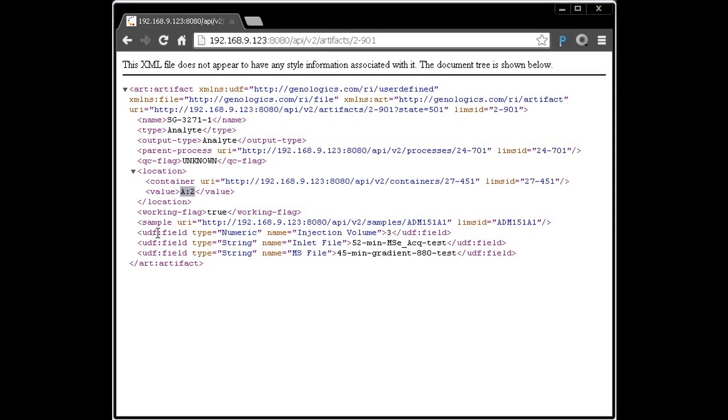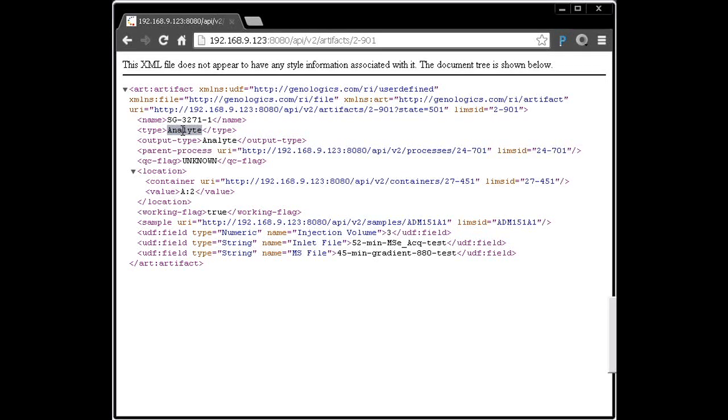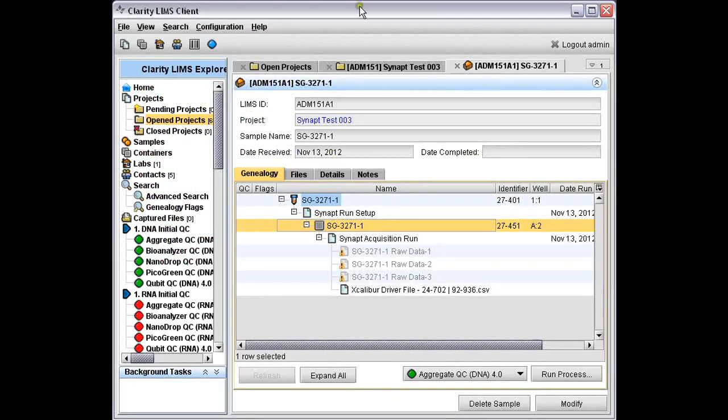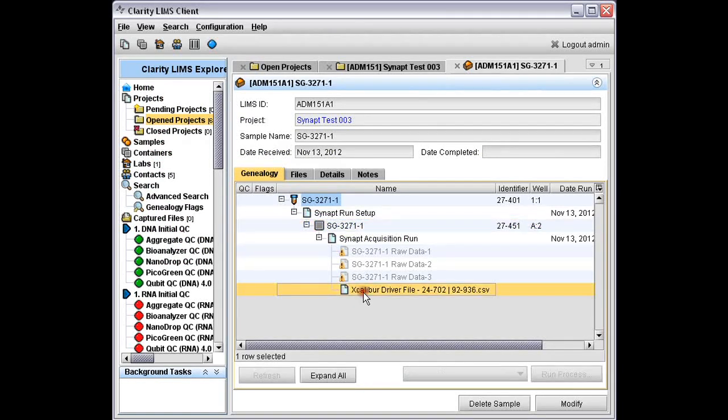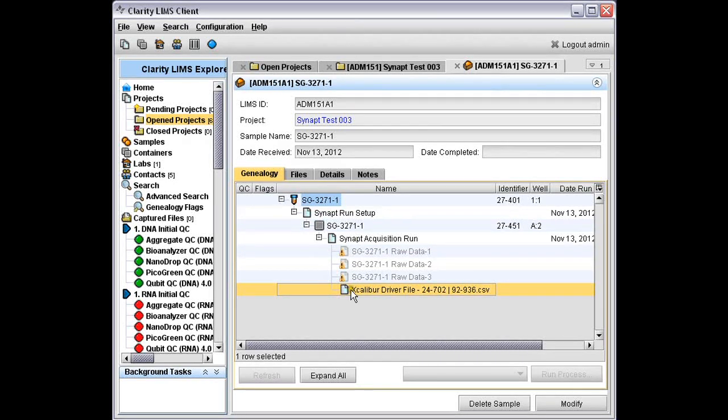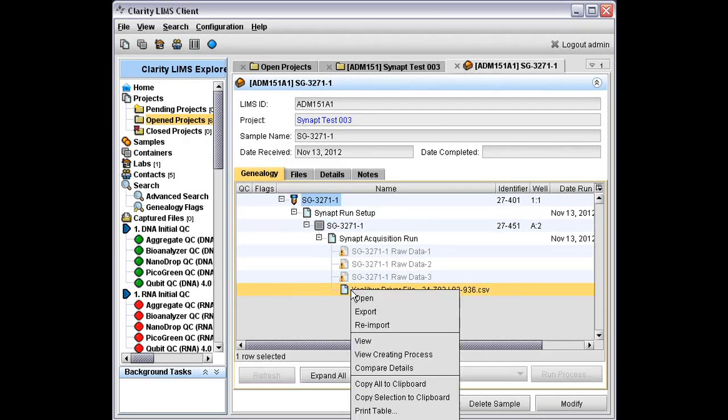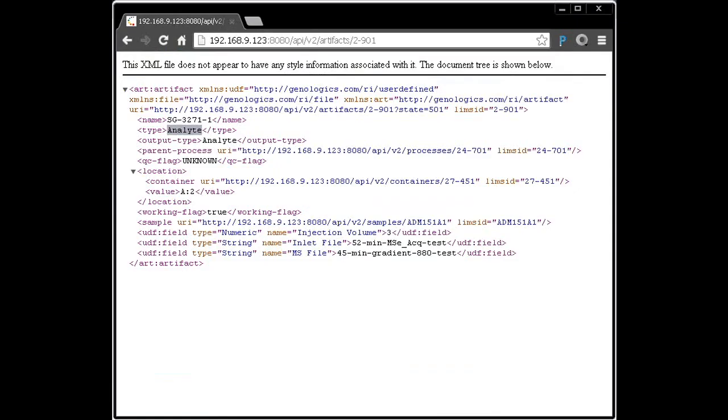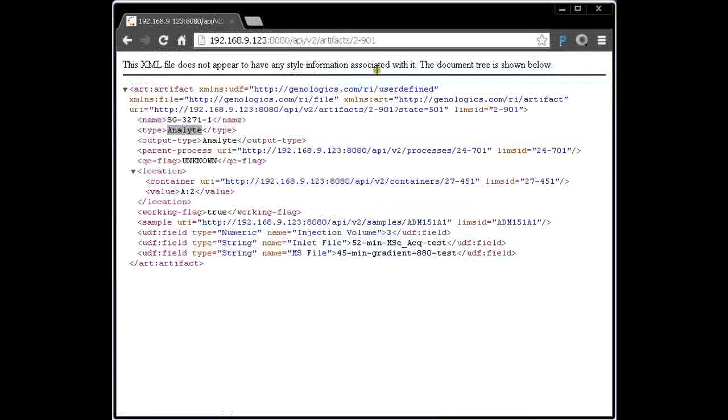We're looking at artifacts of type analyte. There are other types of artifacts which map to result files. In the same genealogy, if I switch back to the LIMS, in this genealogy I've got a result file that has been produced by a process. Let's go and see what that looks like as far as the API is concerned. Copy its LIMS ID to the clipboard again, switch back.